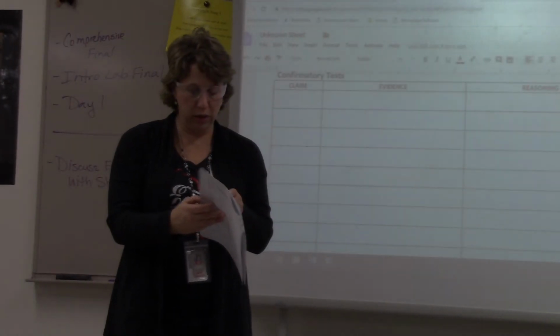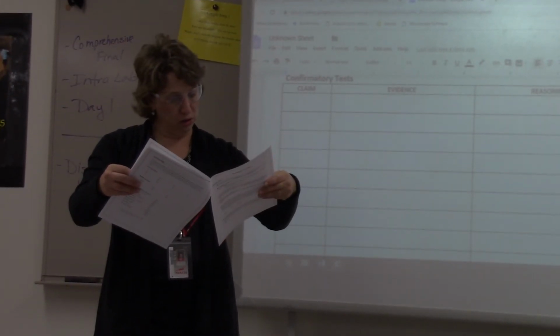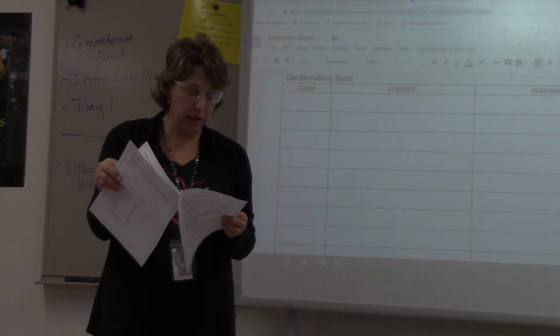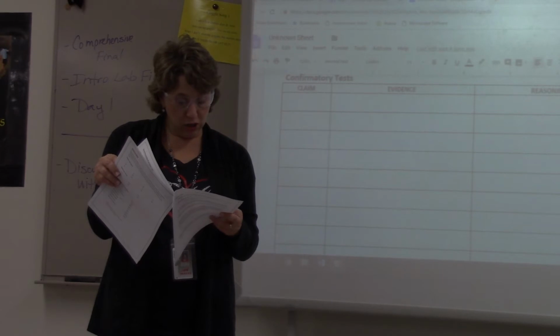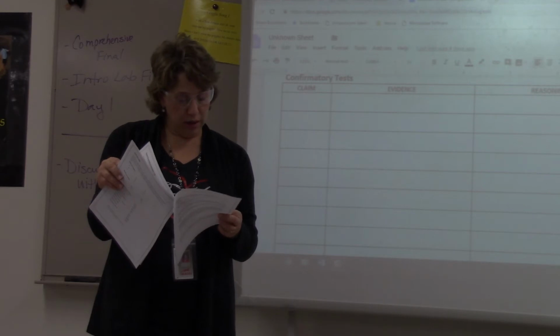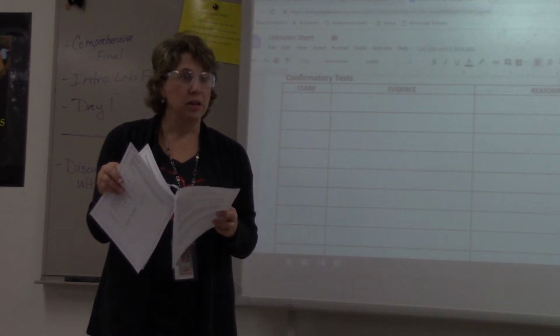Okay, so we're now down here on the confirmatory test. We think we have iron, but we need to look for some other confirmatory tests. So first of all, let's work on iron since we're really close and we think we know what it is. Are there any additional confirmatory tests that I could try? We look at one, characteristic flame color. That's a preliminary test, we've already done that. Number 2, it's colored, we've done that. They change the pH of a solution. That also matches up above, would you agree? And then our last one is hydroxide ions form colored precipitates with iron. I have not done that confirmatory test, so I now need to do that.